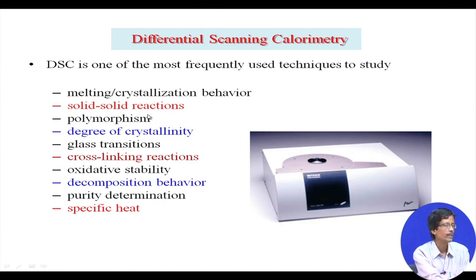So, the DSC trace for a particular type of solid state reaction. We all know that you can go for a simple metal complex preparation. One good example is the well-known preparation of Reineke salt. The preparation of Reineke salt can be done by using simple solid-solid reactions. On a sand bath we heat one solid component with the other solid component, but the ultimate product is a well-known, different type of metal complex.